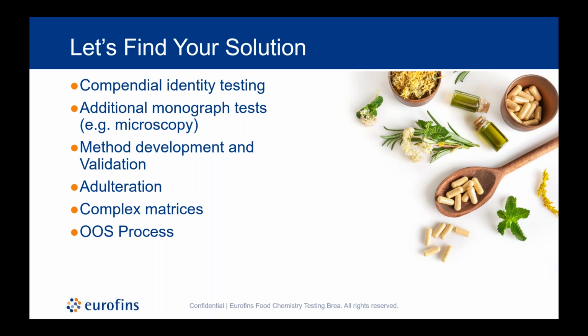And so more than just being able to submit it for testing, you really want to have that information to ensure that your products are not adulterated and that they're effective and safe. And so that's where being an expert in the products that you're testing is going to go a long way in determining the appropriate testing and getting a solid protocol in place.